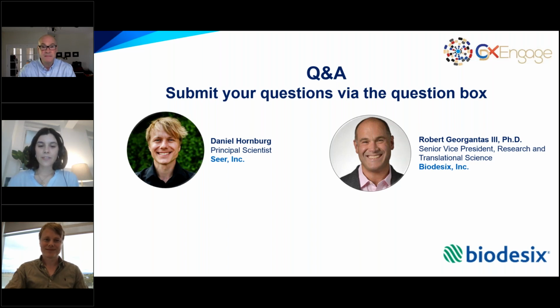Great. And have you used this technology to test preclinical species such as rat or monkey plasma proteome? That's a question for me, I guess. Yes. We have internal work that shows that it works, and there's no reason to assume it wouldn't. Especially the plasma composition and the challenge of having too many high abundant proteins obscuring the signal is the same across species.